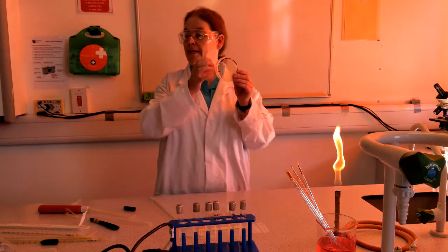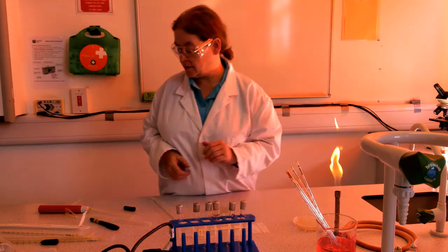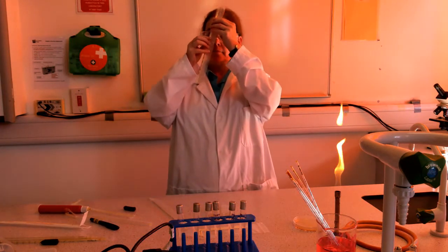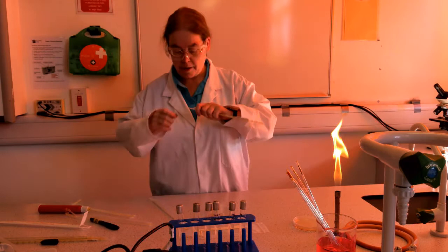So I've labelled my plates. This is the 10,000, working close to the Bunsen, remember? Okay.